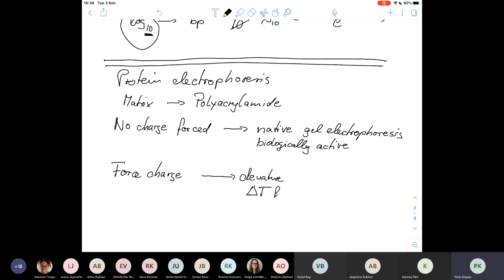So we heat up the protein because we know that when something is heated up, it moves faster and the protein sort of unfolds. And then we add sodium dodecyl sulfate, SDS, because SDS is negatively charged. And this SDS will then attach itself to the protein.